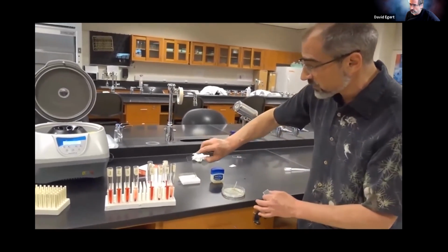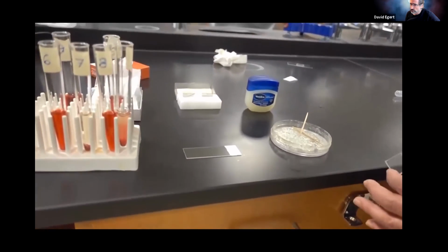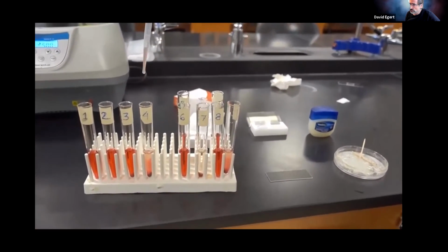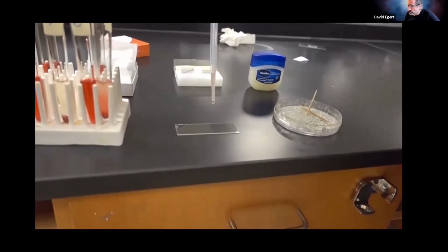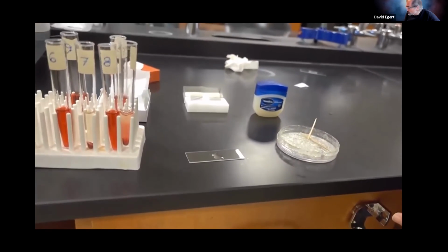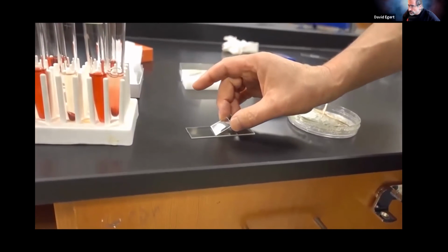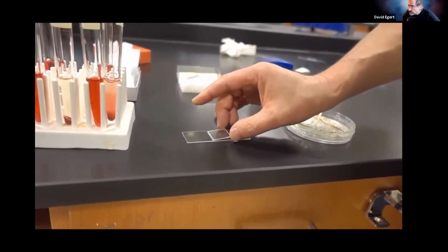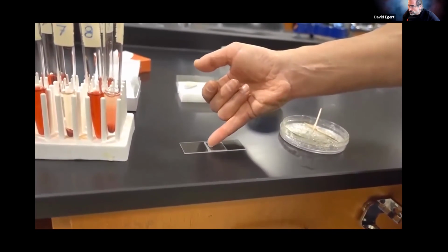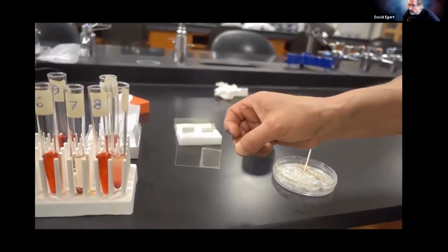So here is my slide. I'm going to take a drop of my resuspended blood cells here. And that's probably plenty. I'm going to take my slide and start one side, drop it down. I'm going to use the back of my fingernail to push it down a little bit. And what we have now is a sealed wet mount.